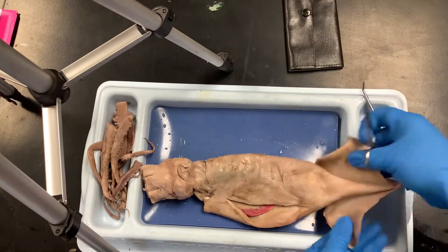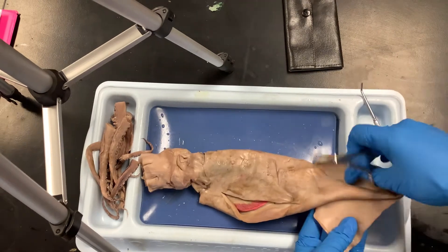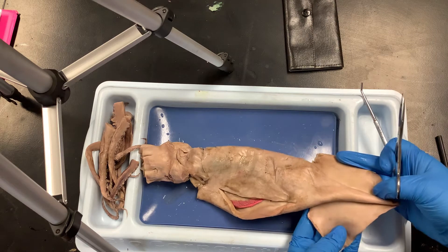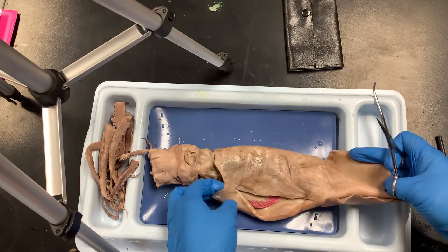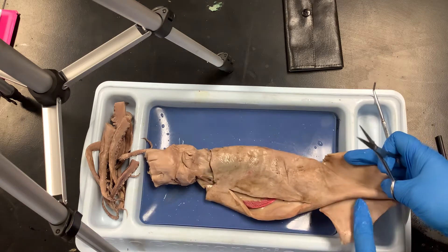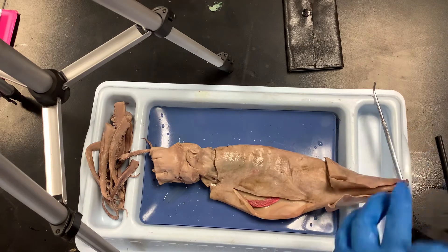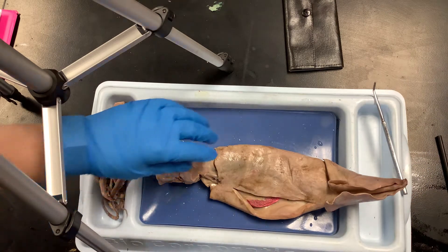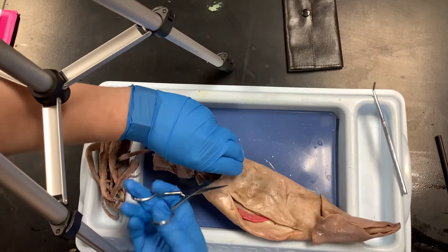Lay your squid down so you can see from the head all the way to the tip, with the fins laid down flat. Then cut just above the siphon all the way up to the tip. Be careful not to cut into an organ — you may need to hold it up.